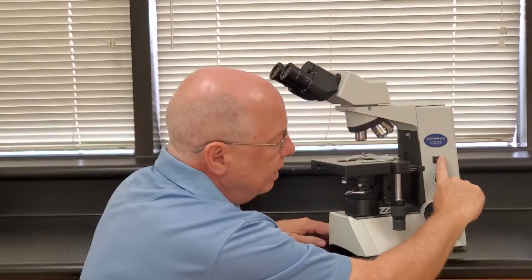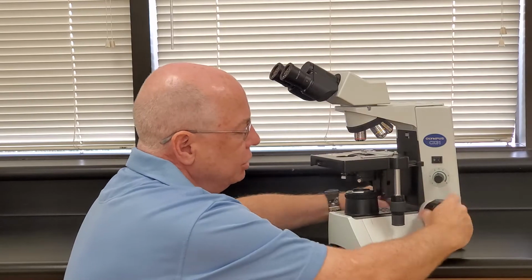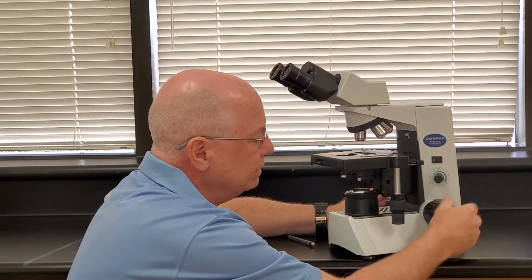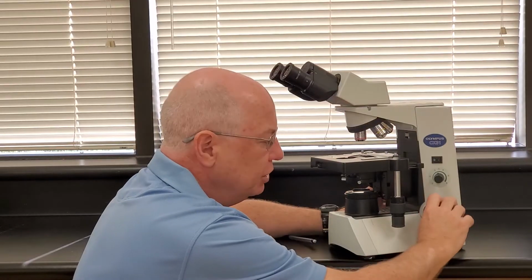Okay, now over here I have the on-off switch or power switch, my light control switch, and then these two knobs are stacked on top of each other. The larger of the two knobs, if I wiggle it and you stare at the stage, you see that the stage moves. Now, if I grab the smaller knob and I turn it, you see that the stage does not appear to move. It's moving, but it's moving in very fine increments, where this one is making very large movements. So we call this the coarse focusing knob and the fine focusing knob. The larger of the two is the coarse focus or rough focus knob, and the smaller is the fine focus knob.